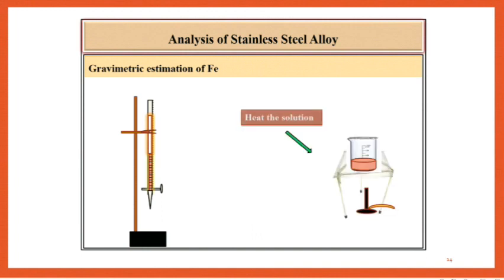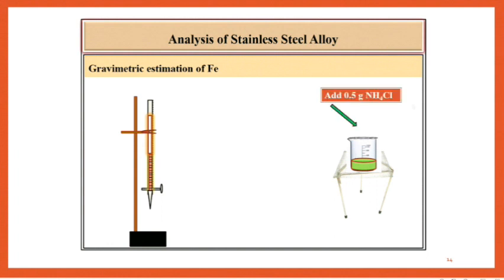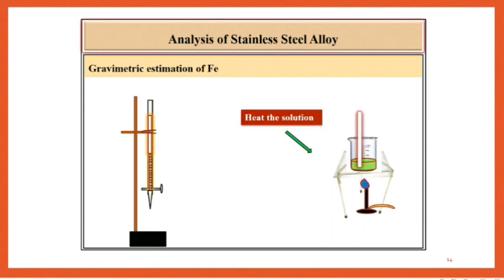Continue heating until the solution becomes yellow-green, then cool the solution. Add 0.5 gram NH4Cl and stir well. Then add 1 to 1 ammonia drop by drop and stir well. Heat the solution for 2 minutes.